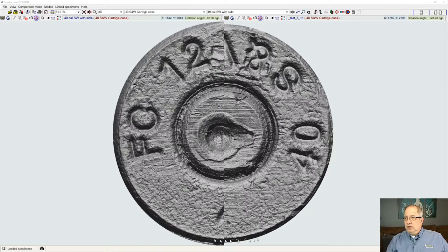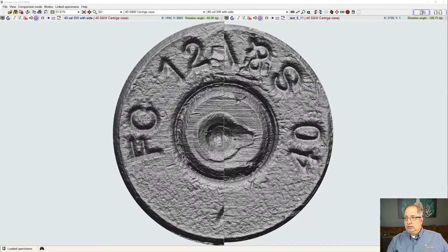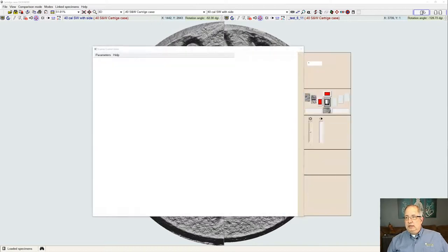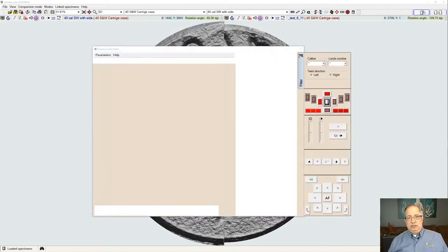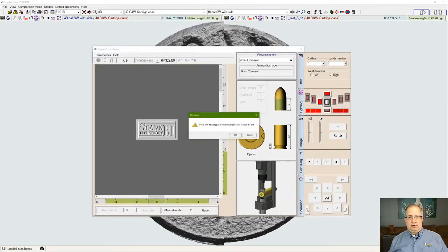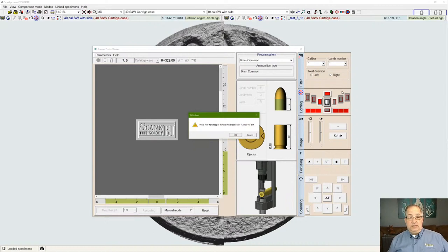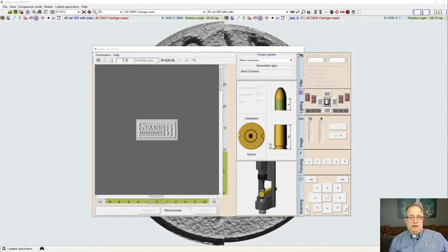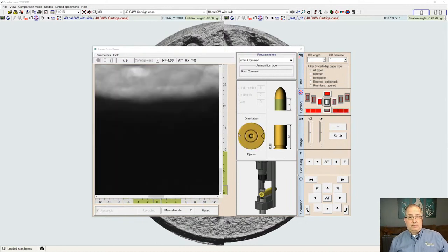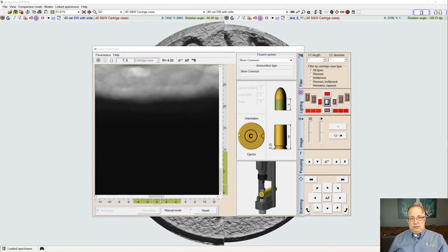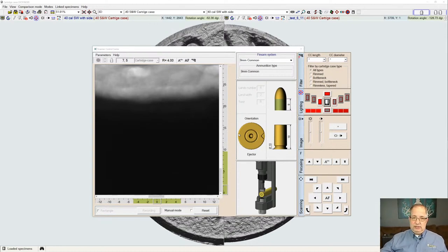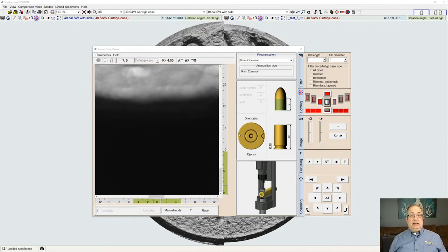The scanner system allows us to mount bullets or cartridge case samples in the scanning system so that we can generate a three-dimensional model and visual representation of the face of a cartridge case, the side of a cartridge case, or the bearing surface of a bullet. These samples don't have to be pristine, and we can still put them in the scanner and generate samples of deformed fragments, deformed bullets, or fragments. One of the nice things about the scanner is that using this single system, we can put any type of these samples in there and generate an image.